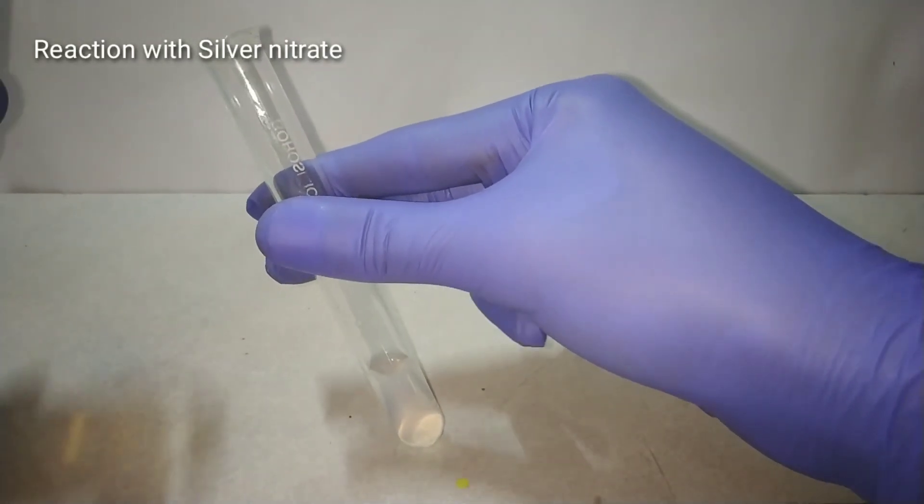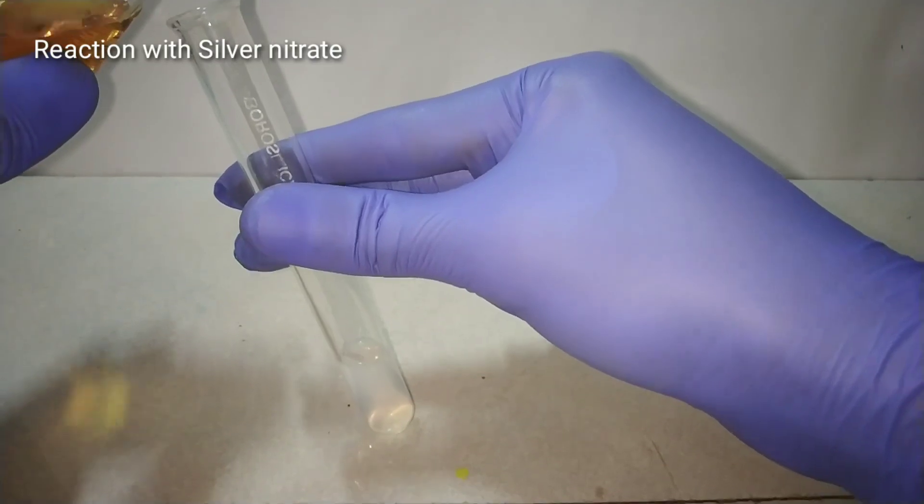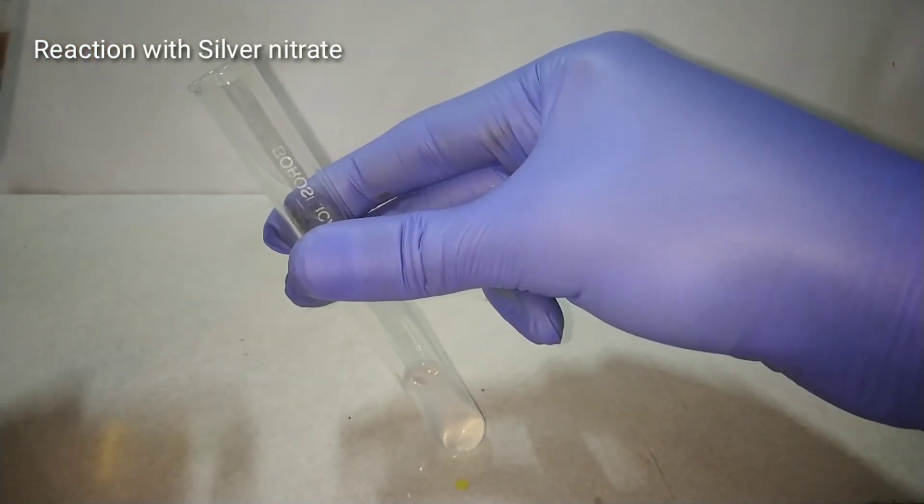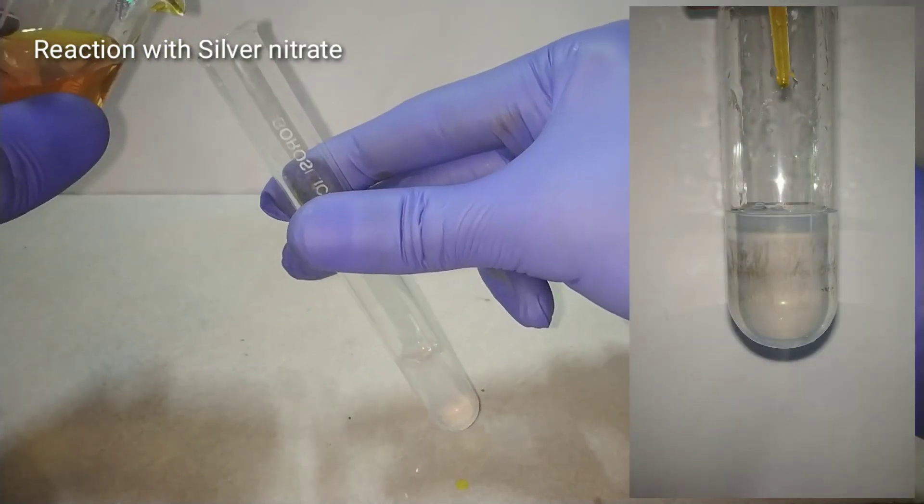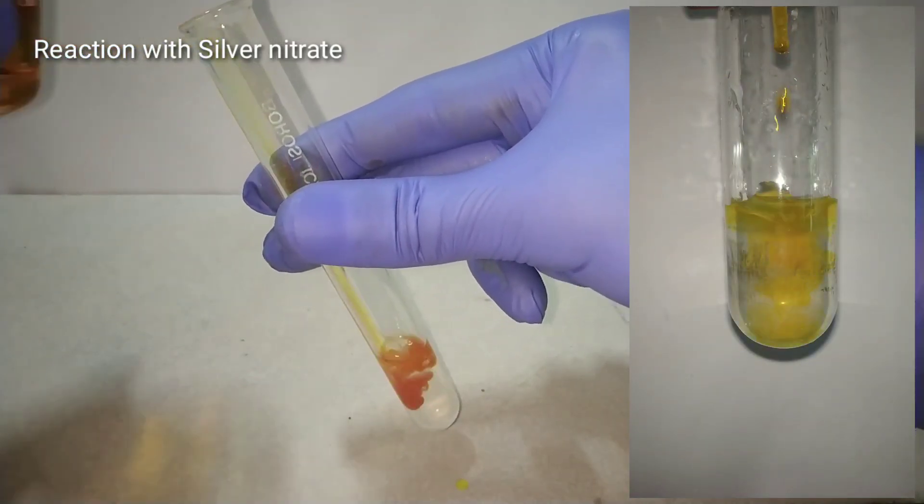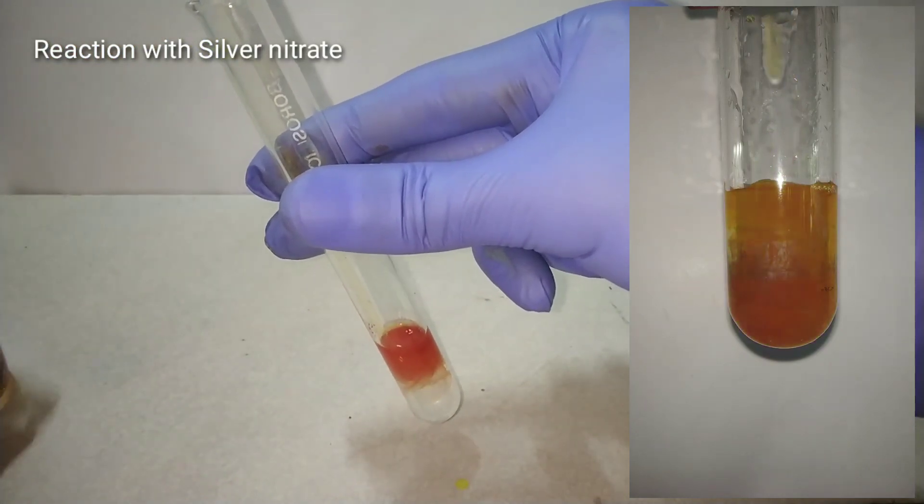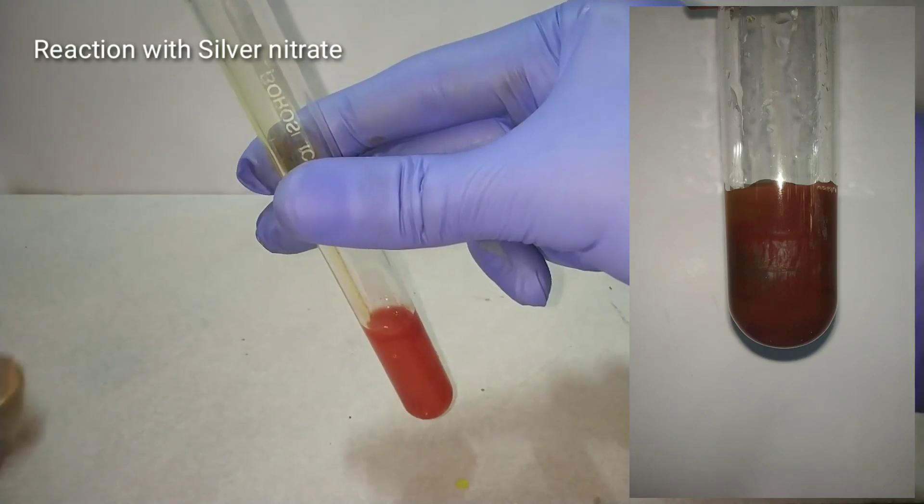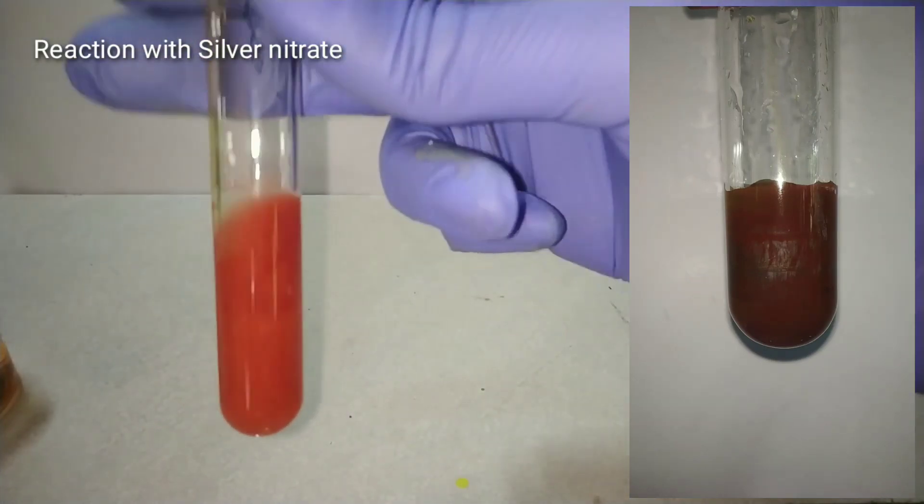Now let us see the reaction of ammonium dichromate with silver nitrate. I am adding some ammonium dichromate solution into silver nitrate. You can see that on adding the ammonium dichromate there is formation of a red colored precipitate of silver dichromate.